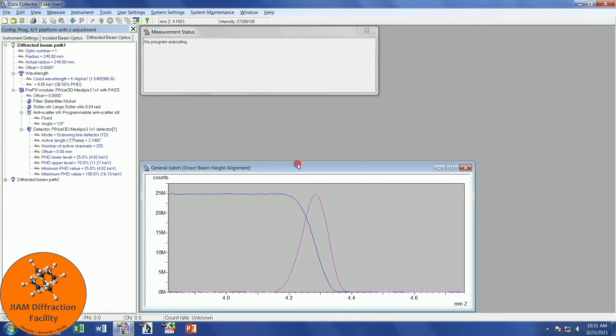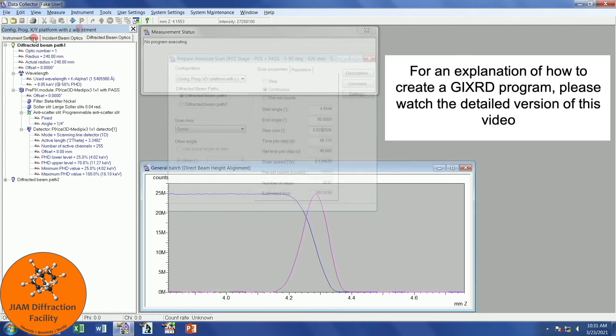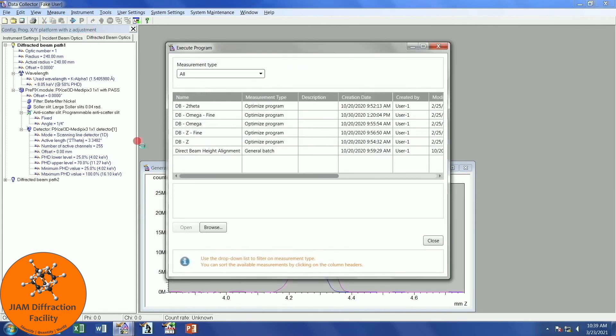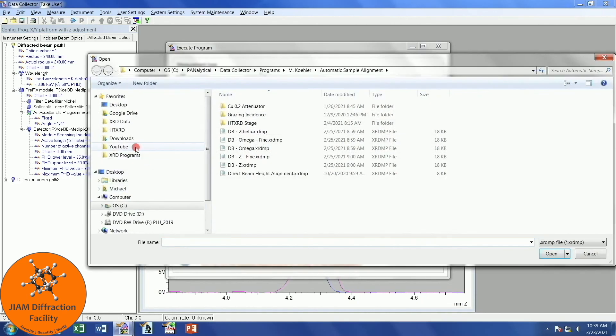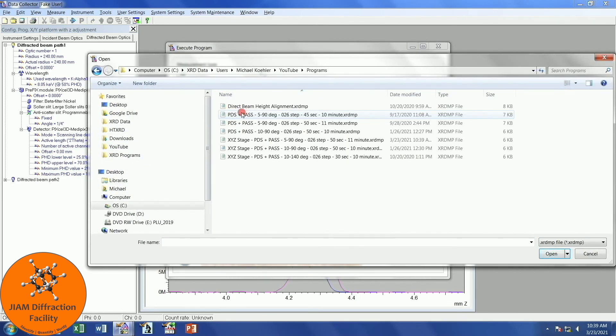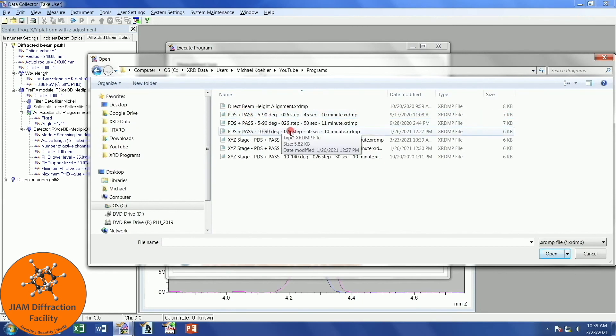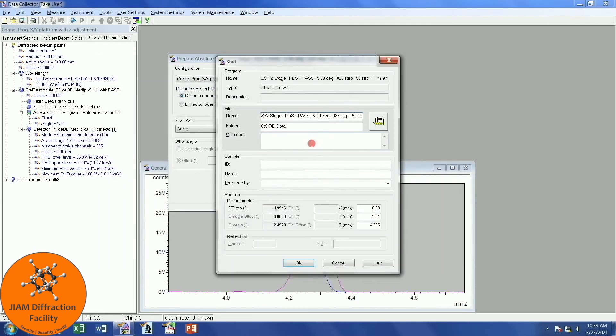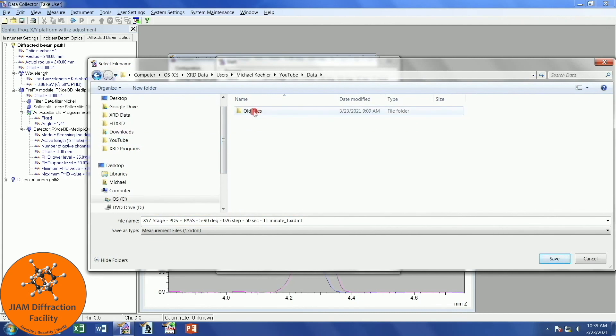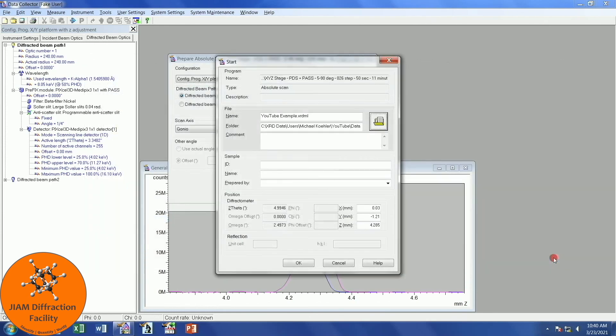Now that all of our optics and tabs are set up correctly, I am ready to either make a program or measure a program to collect my data. I will just go to measure, program. Let me navigate to my YouTube folder. Programs. And this is the one I want. XYZ stage. It should be this one. I will double click. I will click the folder icon here to choose where I want to save it. I will put it in my data folder. And I will just name this YouTube example. You can name it whatever you like. Click save. And then OK. I will close this.